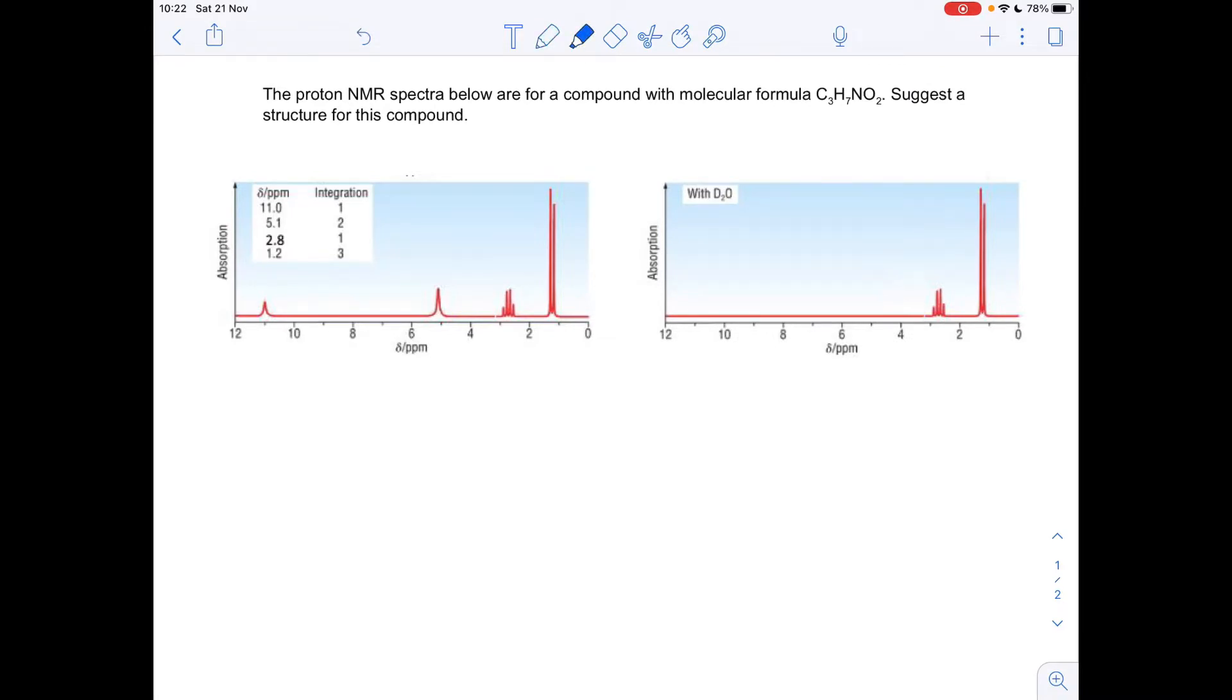So the first thing we're just going to say is you'll notice that the spectrum on the left's got all of the peaks on. That's not done in D2O. And then when you put it in D2O, you've lost these two peaks here. So they're going to be due to OH protons or NH protons.